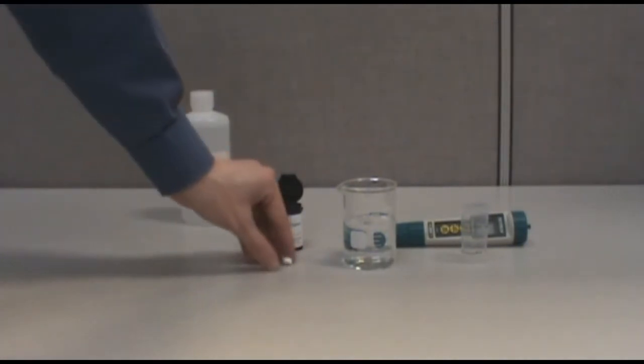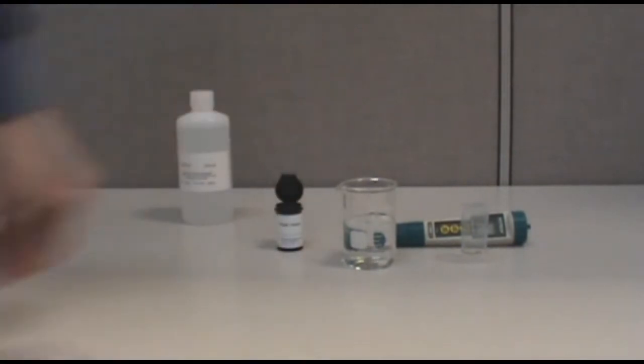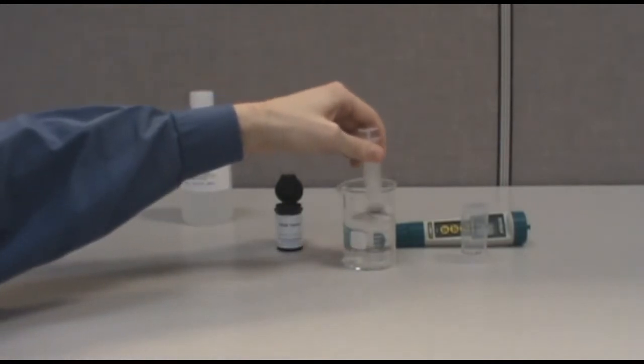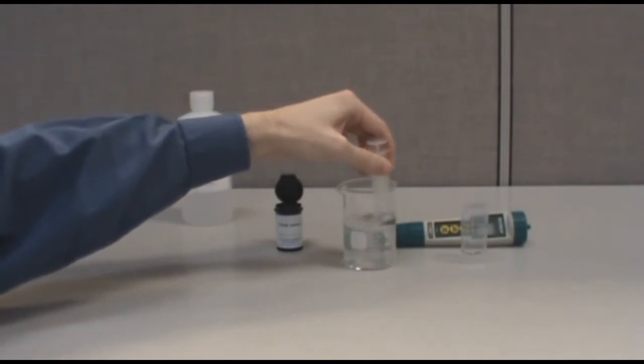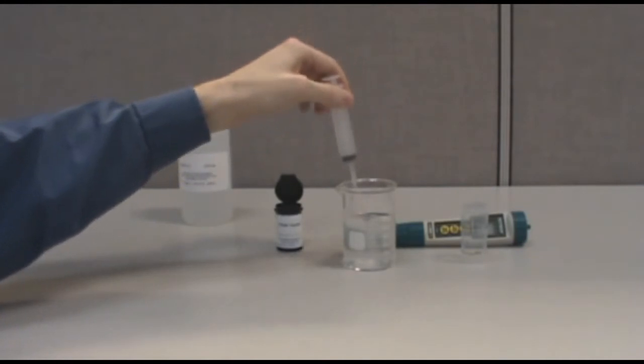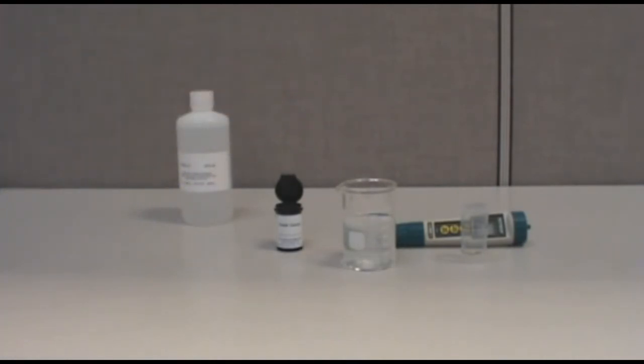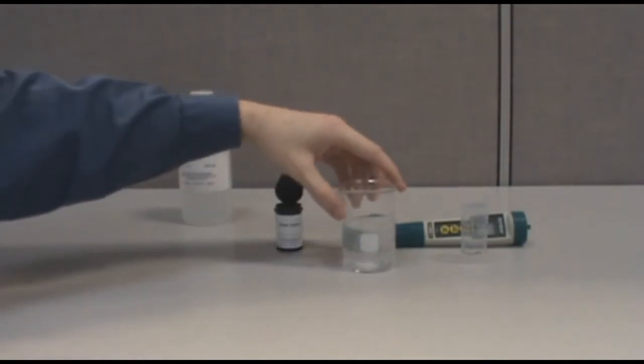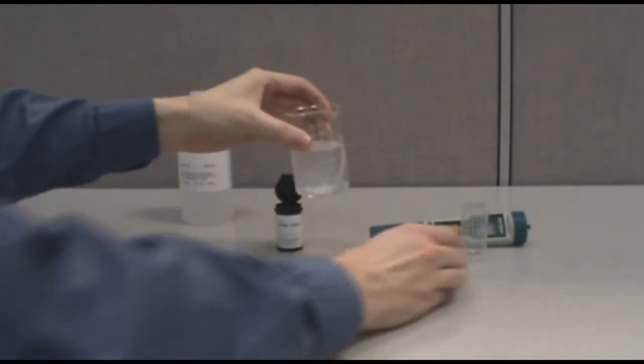To calibrate the meter, first dissolve a reagent tablet in your 1 part per million standard. Pour 15 to 20 milliliters of the prepared solution into the sample cup.